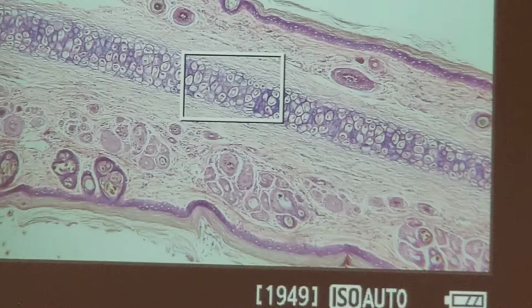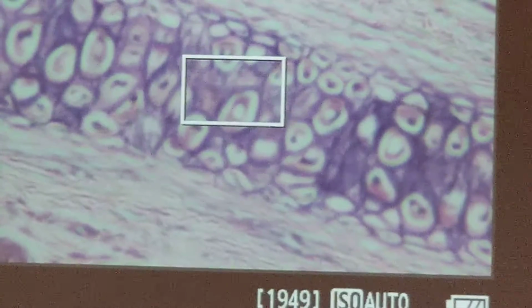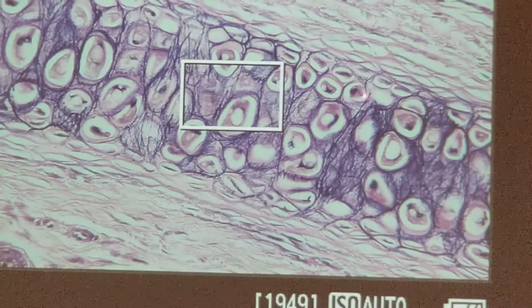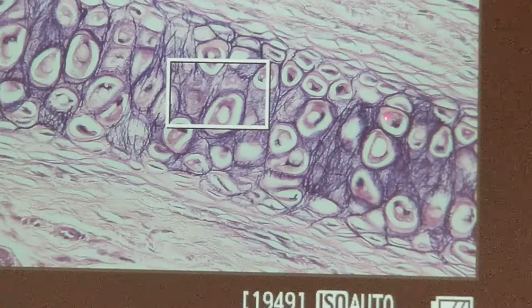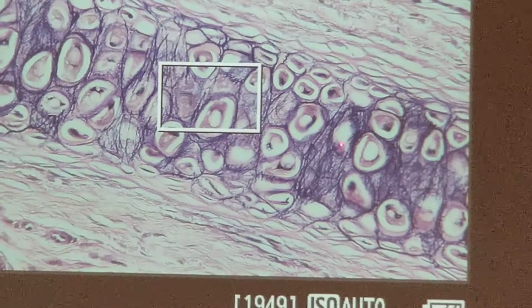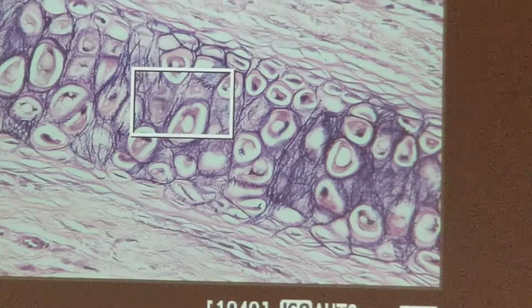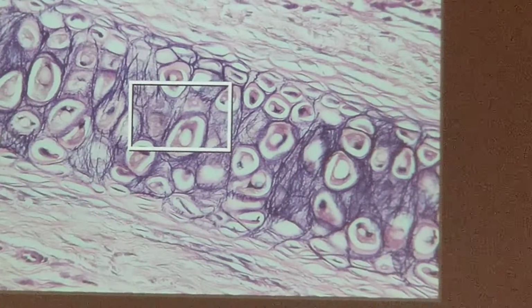Better. You can already see the chondrocytes in the lacunae, right? So we got 40. There you go. So these are the chondrocytes in the lacunae right there. You guys see these fine little lines right here? Those are your elastic fibers. They're very thin. Okay, you can see a big network of them right in here. And then what's this going a different direction across the top and across the bottom? Perichondrium, right? It's labeled as part of it, top, bottom, both there. Okay.